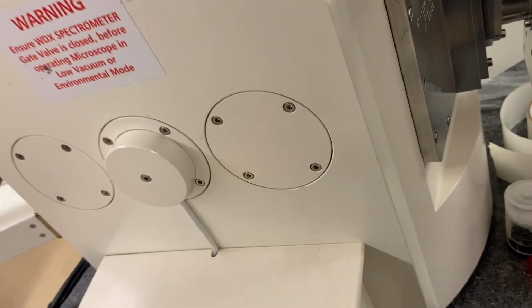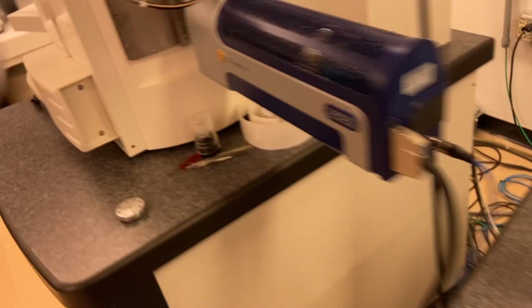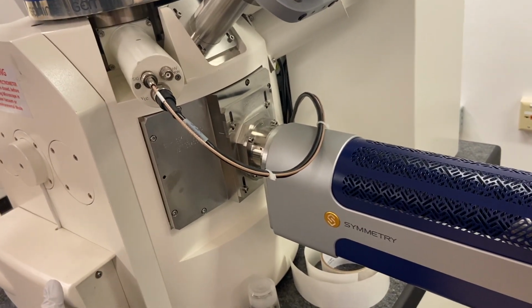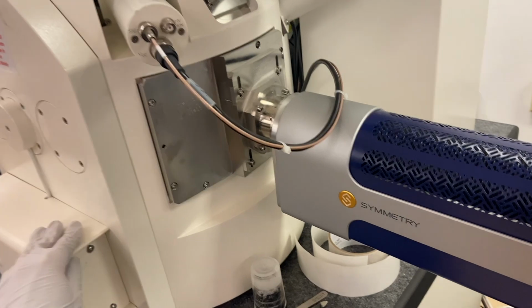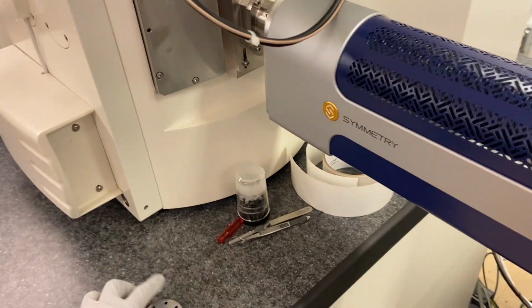And now I have to pump back up the vacuum. Initially I vented the chamber, so I brought it up to air pressure. Now I'm just pumping it back down to high vacuum settings, so I'm essentially going to extremely low pressure. Whenever you pump the chamber, you're pumping it down to vacuum, so you're decreasing pressure. And whenever you're venting, you're going back up to the ambient pressure in the room. Otherwise, this door wouldn't exactly open, right? Because you have to get pressure equalized on both ends. So anyway, it's in now.